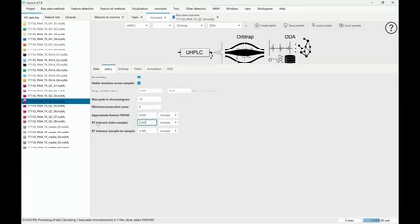There are other retention time tolerances down here. There's one retention time tolerance within your samples. In the same scans, if we have isotopes and adducts, they should have the same retention time, but sometimes they have a little bit of a different shape. They should not, but usually we still need some tolerance to pick the isotopes and the adducts of the same molecule. This is the intra-sample tolerance. It's usually quite low, maybe the same as the full width half maximum, because when the peaks get wider, that tolerance also needs to be widened, since getting the top of a wide peak is much harder than if it's very narrow.